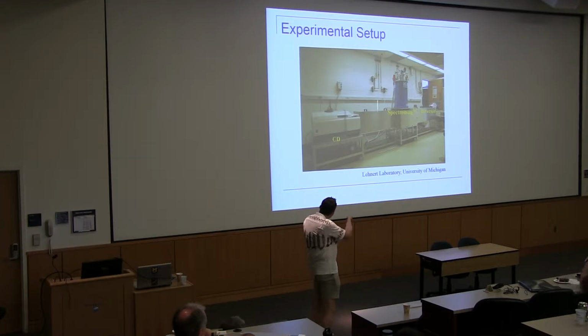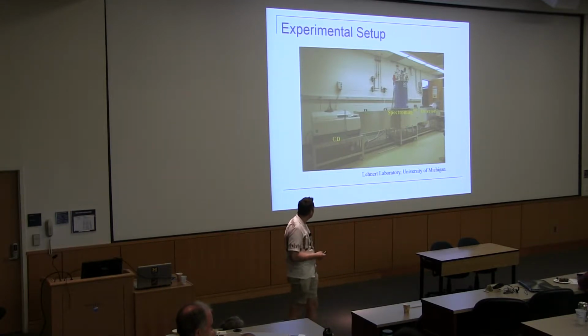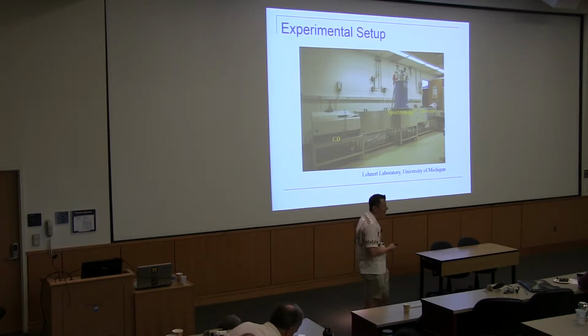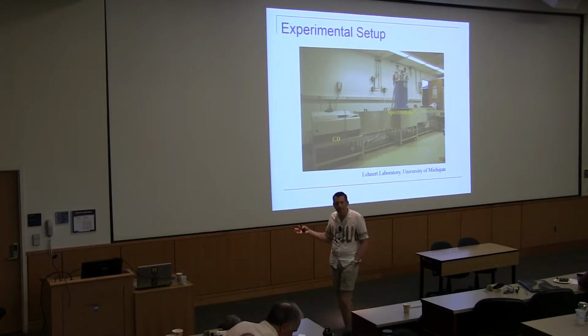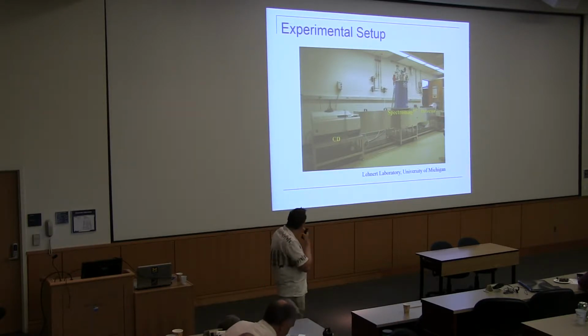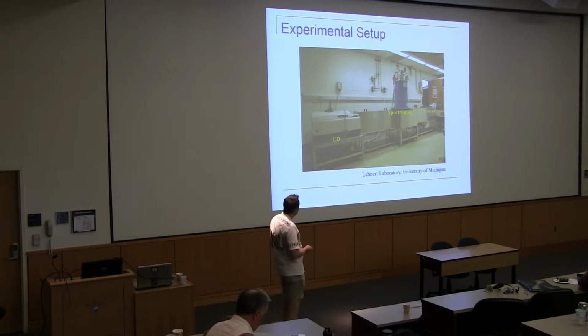So here's our cryomagnet, a typical Oxford magnet, where we have the sample down here. You can't see this now, in an optical tailpiece, and we cool this with liquid helium, and there is a superconducting magnet in there that can go up to typical fields of 7 or 8 Tesla. There's an additional cost that arises from the fact that you have to cool that magnet to run the experiment. And then the detector sits here somewhere at the end of this box.